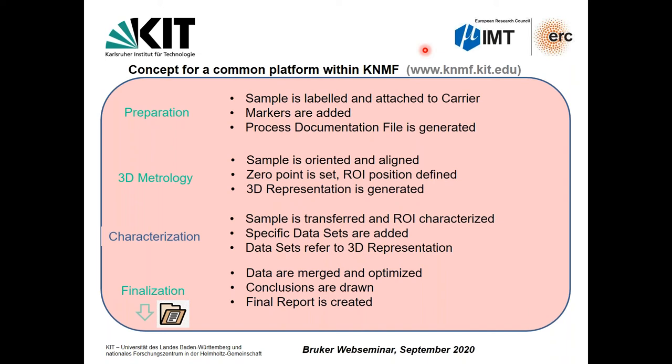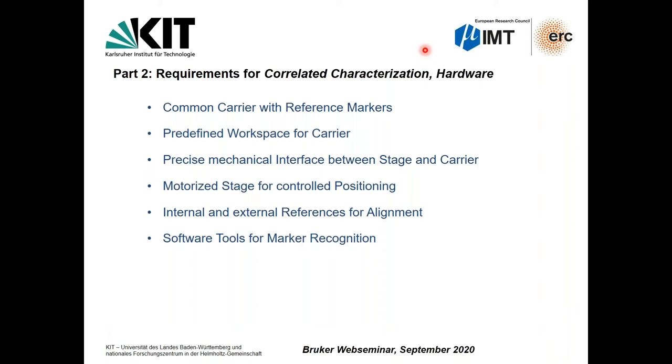And then you have to compare that, to merge them, to superpose them, and to finalize them by analyzing what can be seen within that data. And this is something we are trying to do. So we have some very easy requirements as seen here. I won't read that, but we have to have some standardization to get it done. That is what you see.